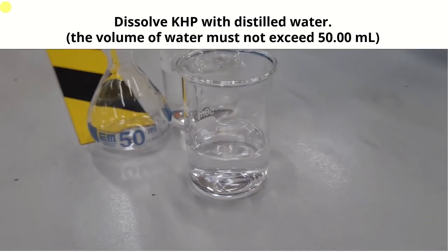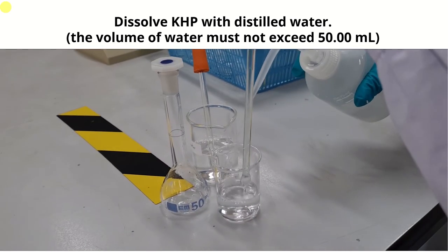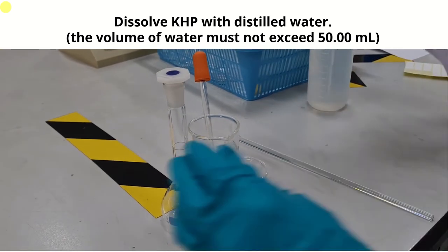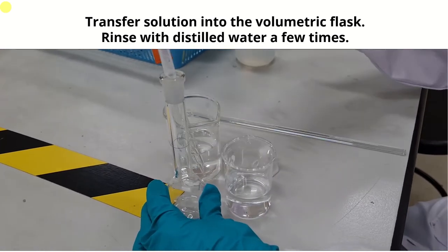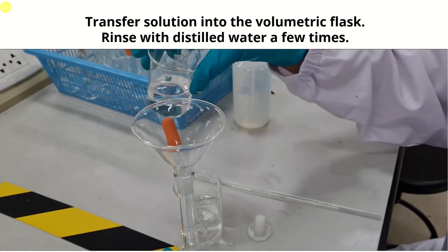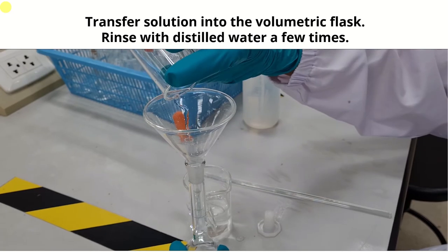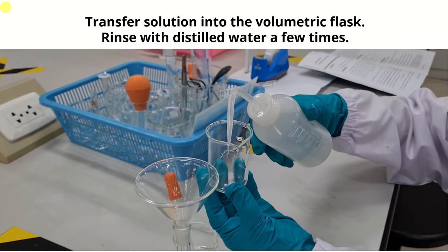Once you get the clear solution like this, okay, rinse the stirrer a bit. Transfer the clear solution into the volumetric flask. And rinse the beaker a few times.